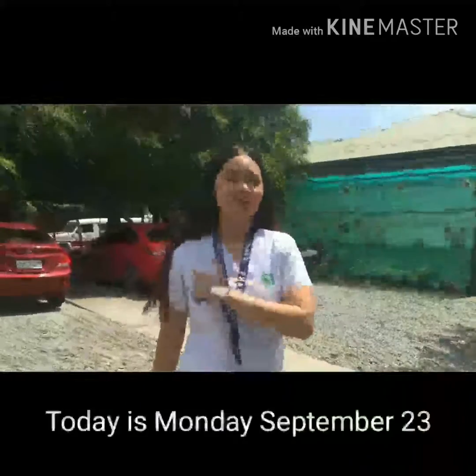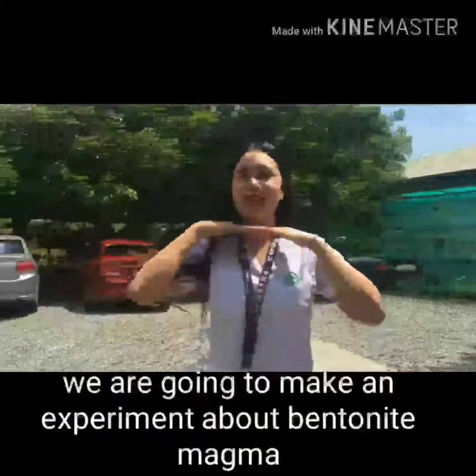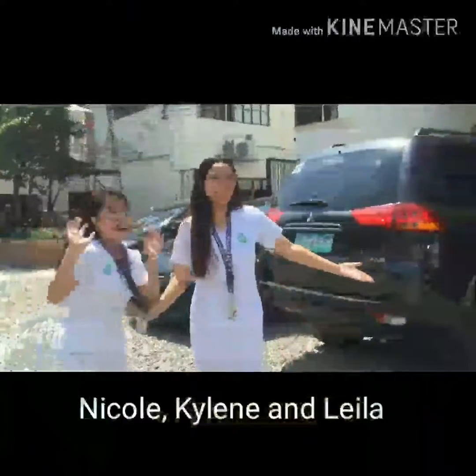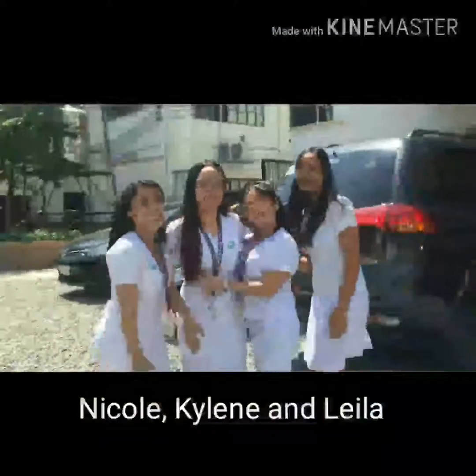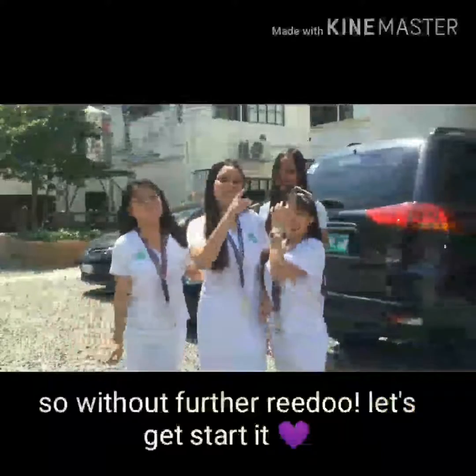Hey Pharmazish! Today is Monday, September 23. And for today's video, we are going to make an experiment about bentonite magma. I would like to introduce to you my special guests, Kailin and Leila. Say hi to the vlog! Hi! So, without further ado, let's get started.